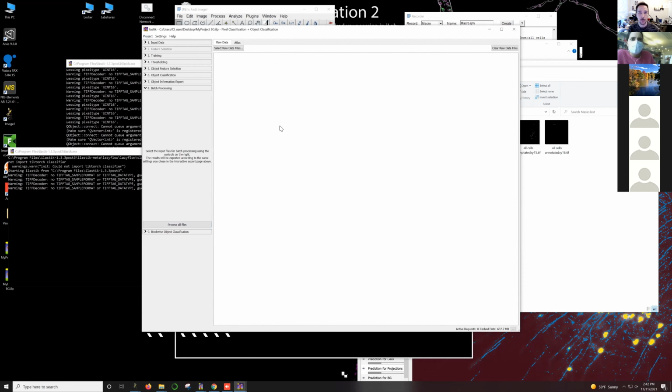Maybe you have some raw data from a microscope. You need to do some processing like filtering, or like I did the background subtraction. Maybe you need to enhance it with another filter first. And then maybe you want to do some analysis afterwards. So you might want to make some measurements on the intensity of another channel, or do anything that's more complicated than what we can do in Ilastik.